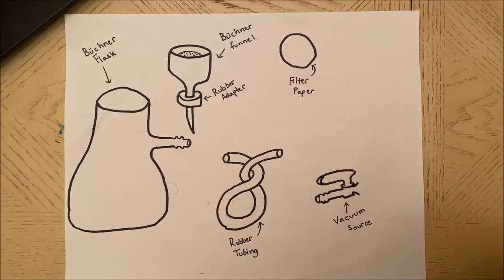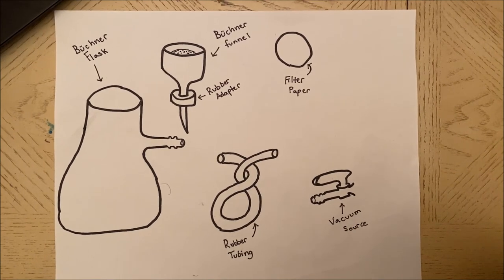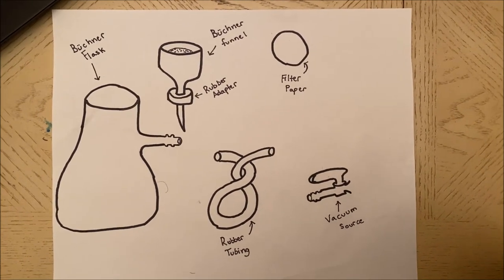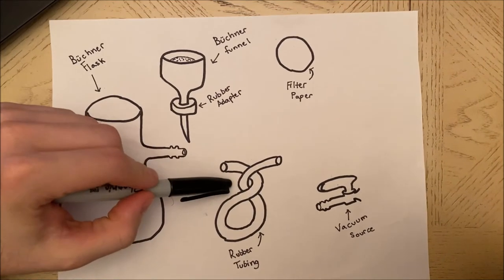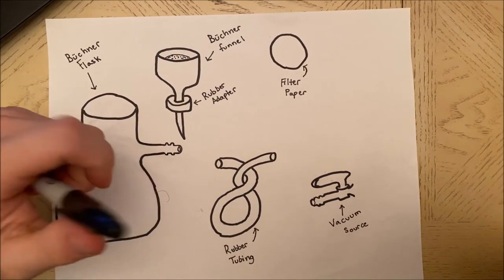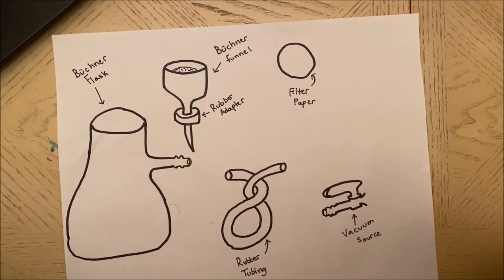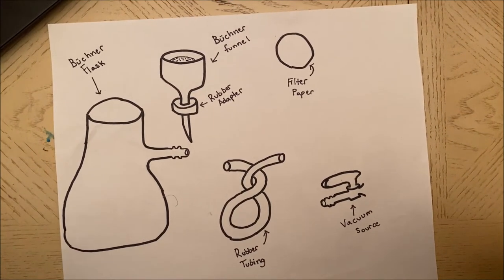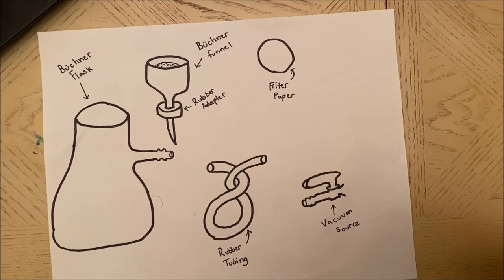A couple precautionary things to note: make sure that our tubing is thick-wall tubing, not tygon tubing. The thick-wall tubing needs to be used because the thinner tubing will sometimes collapse under the reduced pressure and that can cause problems.